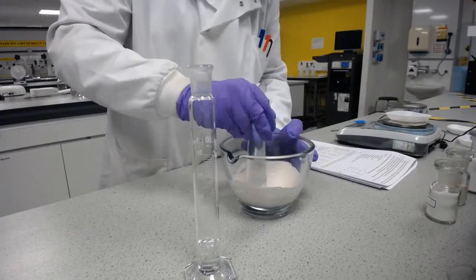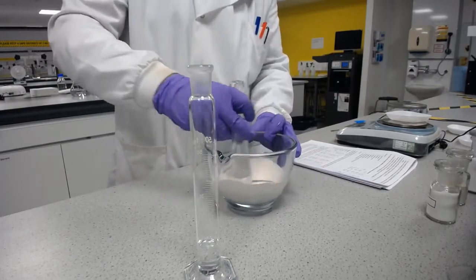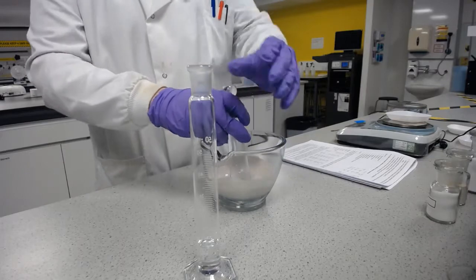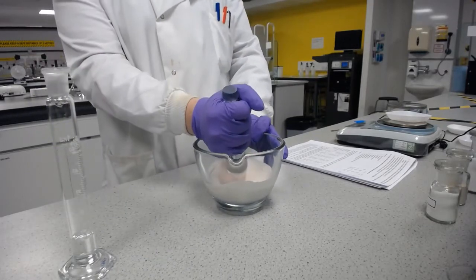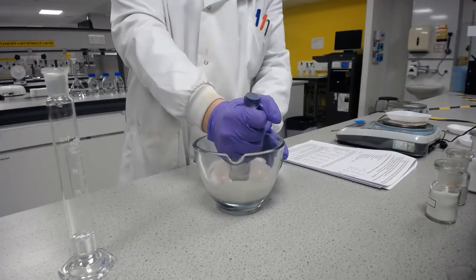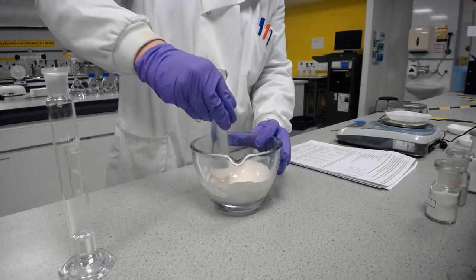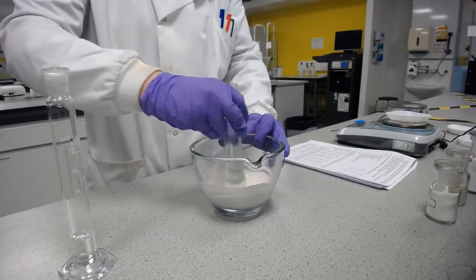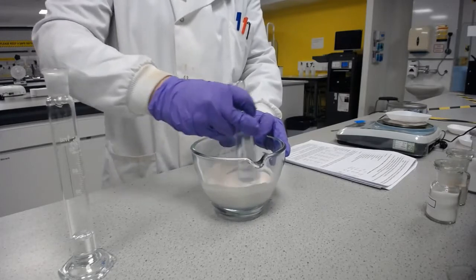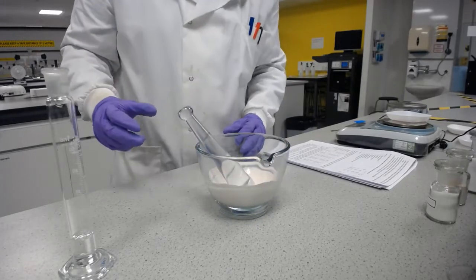I've still got some dry powder in there, so let's keep going. Now remember, just look at what I'm doing. It's not hard force holding the pestle and mortar like this, really pushing in. It really is strong enough to break lumps down, but not so strong that I'm going to be massively affecting the size of the powder. Okay, so then we've got rid of most of the lumps.